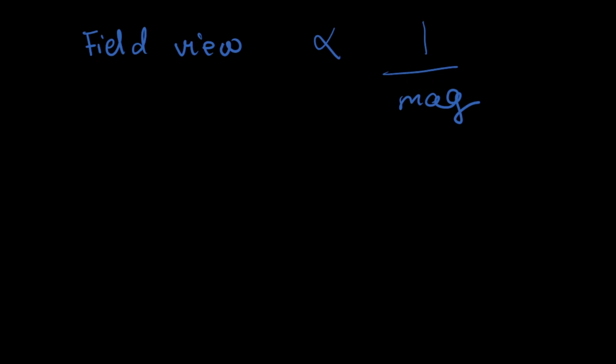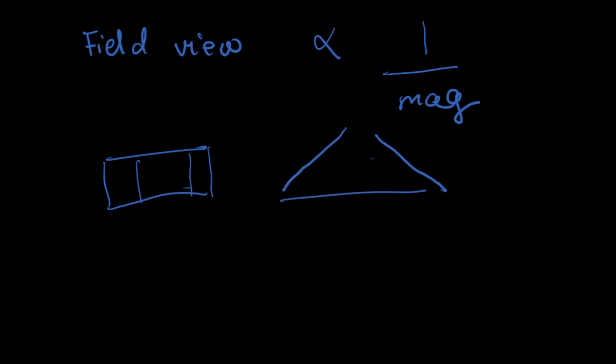Okay, so given a particular tissue slide, at low magnification, we are able to view, take for instance, the entire tissue slide. So we are able to see this entire structure. This is the field of view. Okay, the field of view.